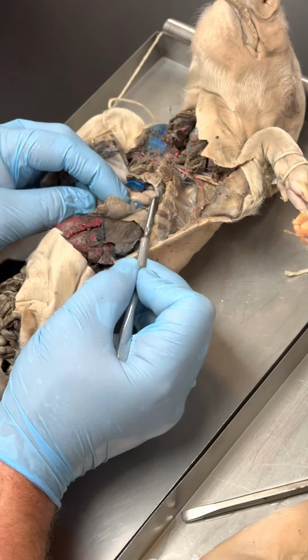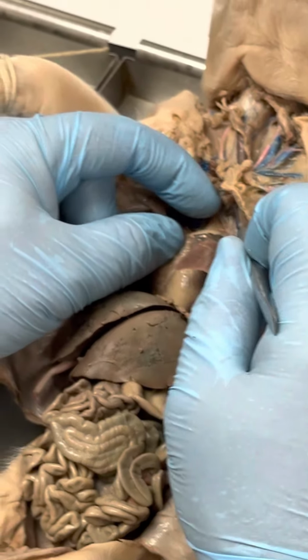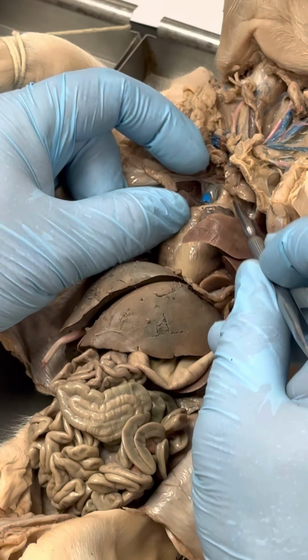Let me show you on this other pig. Oh gosh, it's way in there. I don't know if you can see it. Well, I can see it. I don't care if you can see it or not. This is your aortic arch.